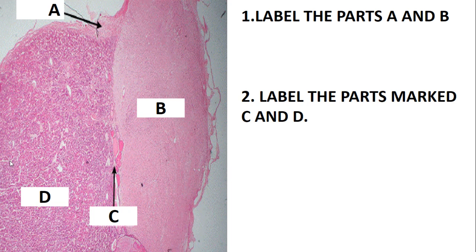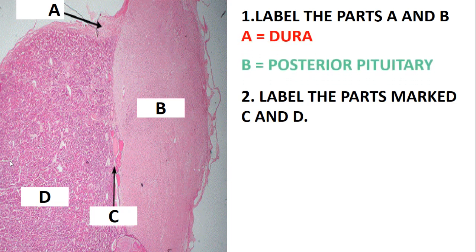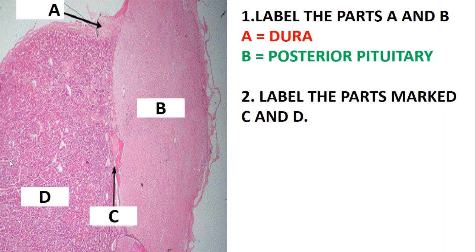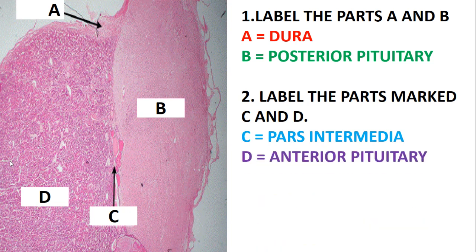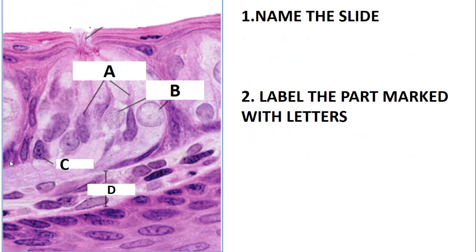This slide is the pituitary gland. The pituitary gland has two main parts — the anterior pituitary gland and the posterior pituitary gland — but there are also other components such as the pars intermedia, the dura mater, and the infundibulum. The part labeled A is the dura, B is the posterior lobe of the pituitary gland, C is the pars intermedia, and D is the anterior pituitary.